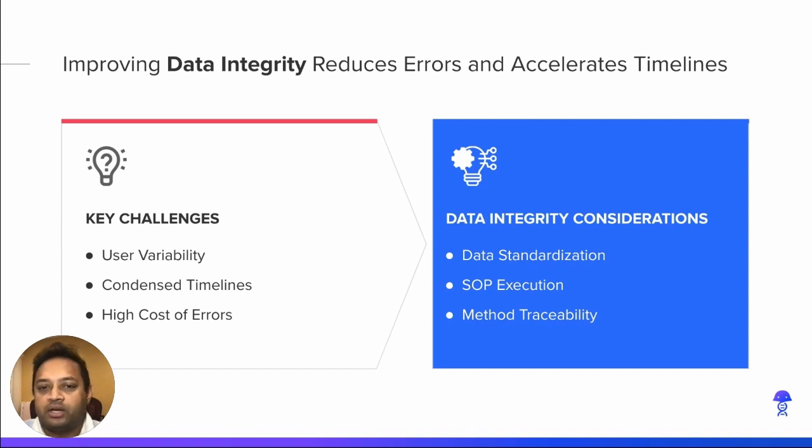The topic is so important that both the FDA and MHRA have guidance documents on this topic. A good digital solution should improve data integrity by standardizing data capture across analysts, enabling consistent SOP execution, and providing full traceability of methods and samples used in the bioanalysis.